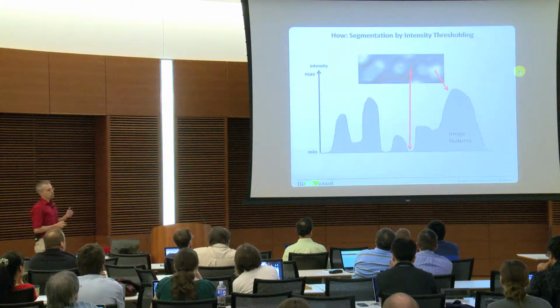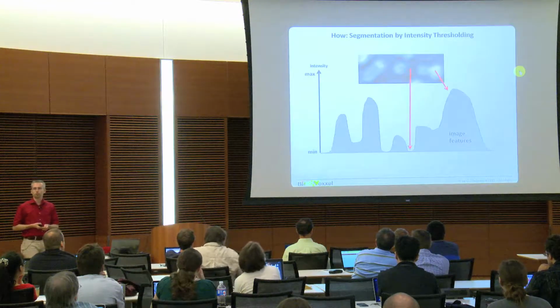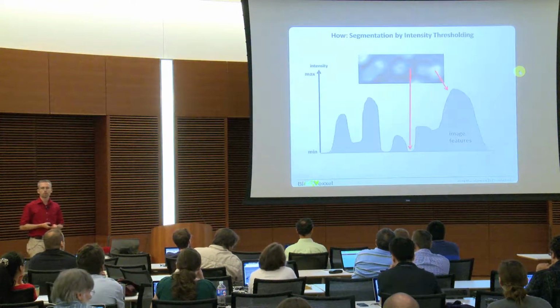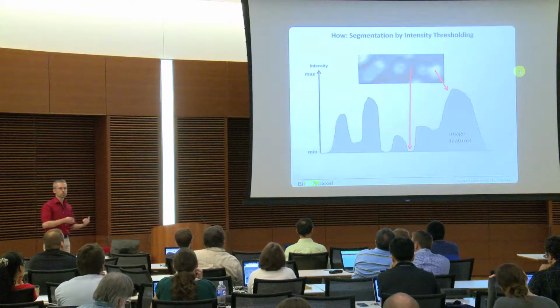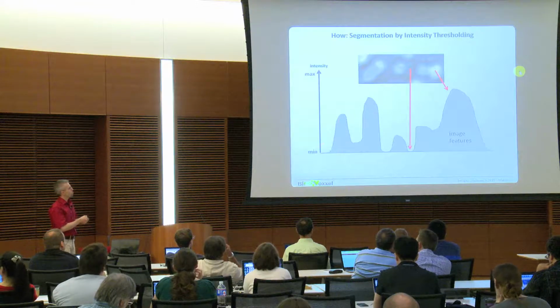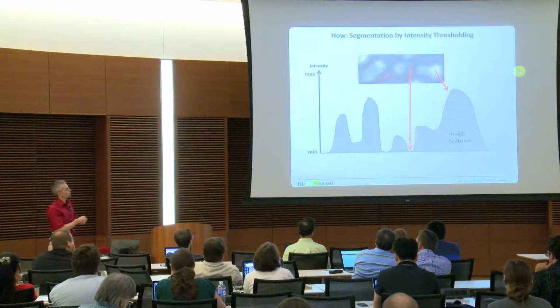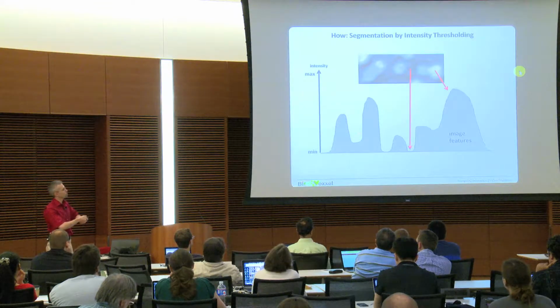So how is this done? The segmentation in its easiest or simplest case is done by a binarization. That means we divide the image into two parts: interesting and non-interesting, or foreground and background. Since we have intensities in our image, with bright objects and a dark background, you can see that as a landscape.